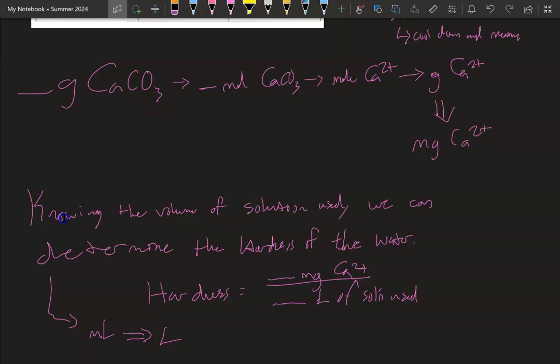Even in fact, if you boiled it, it would start to form this thick white precipitate on the top where the water boils off. And so that's a good evidence of the water being pretty hard. So we're pretty fortunate. But in the lab, we want to check the hardness of the water.